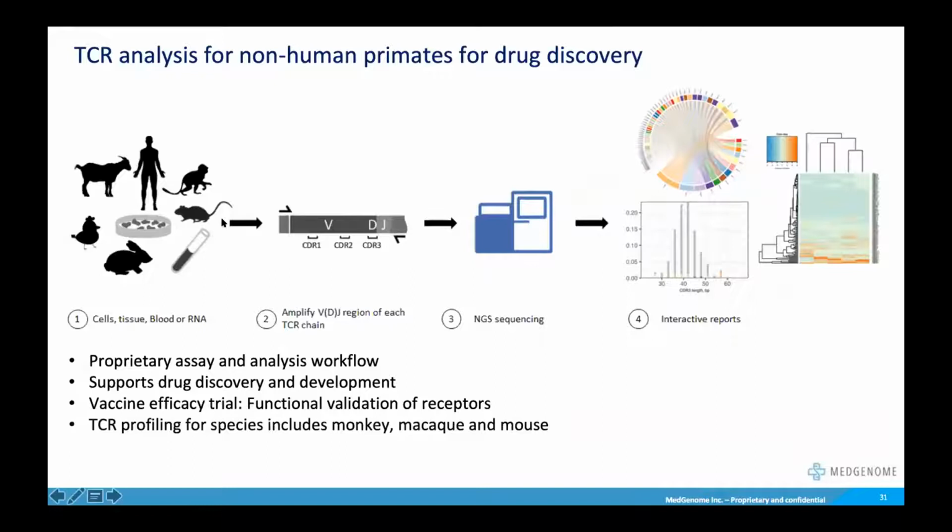Moving on to the immune profiling part of single-cell genomics and transcriptomics in general, there are two flavors of immune profiling. One is TCR profiling, and the other is BCR profiling. TCR analysis has really been prominent in the last few years with the development of two different approaches. One is the bulk approach, and one of the most frequently used applications is provided by Takara Bio, where you can amplify TCR alpha and beta chains, and you can sequence the repertoire that is present in an individual or in a tissue of interest.